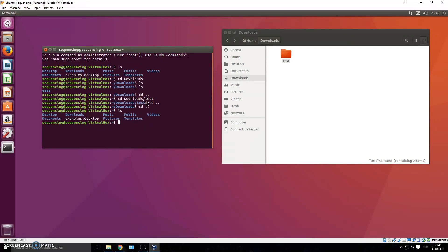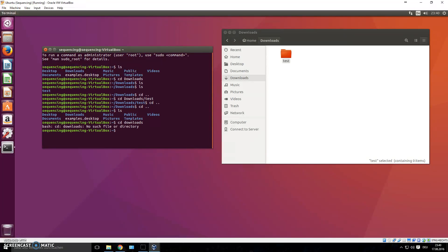Try to follow along on your own computer, because the best way to learn is by typing the commands yourself. You will make mistakes and get frustrated — often it's just a missing dot or a capital letter. For example, typing 'cd Download' with a lowercase 'd' will give you 'no such directory' because the terminal is case-sensitive.